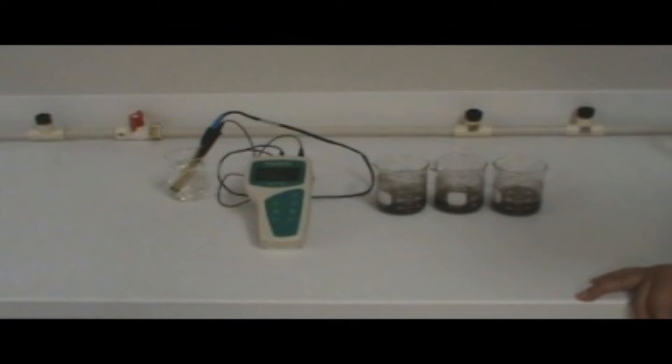you will then require your pH meter, double junction electrode, and ATC probe. Make sure that the meter and electrode are properly calibrated in accordance with the procedure listed in the meter's manual.